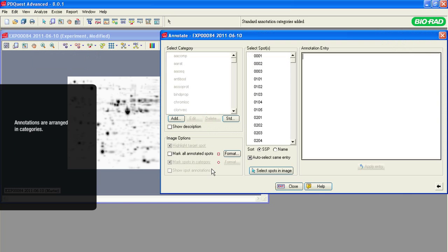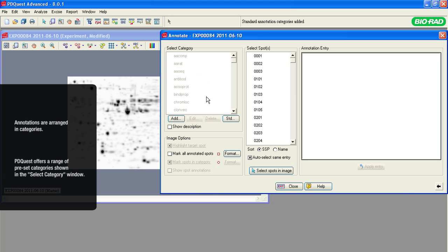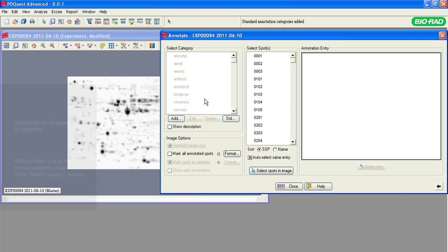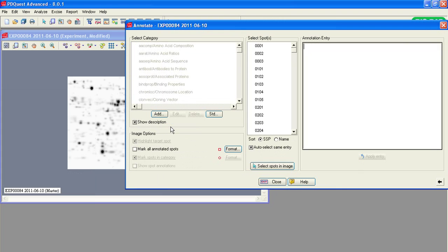Annotations are organized in categories. PDQuest software offers a range of preset categories. You can see the abbreviations for these categories in the Select Category window. Click the Show Description button to see the full name.